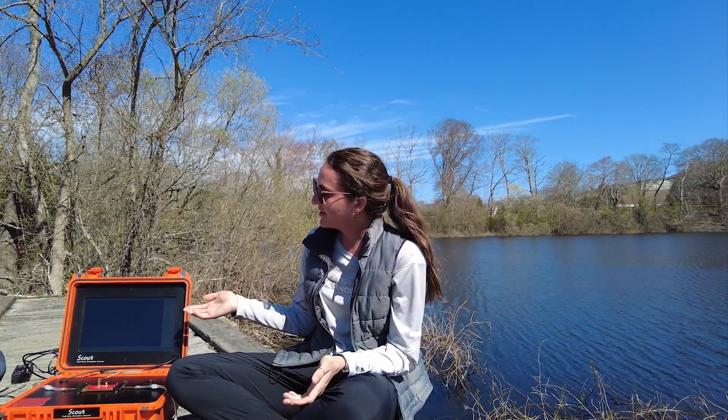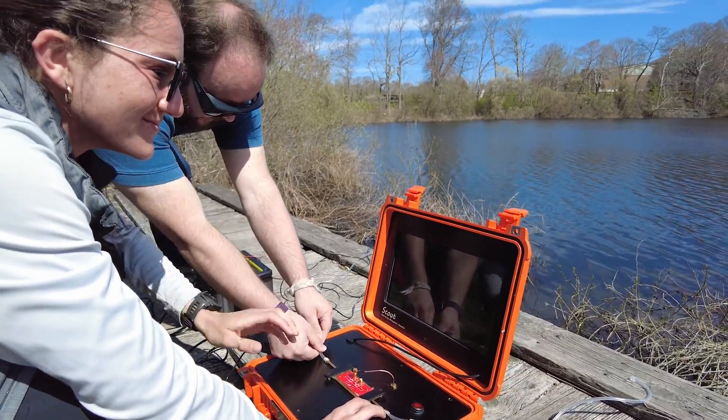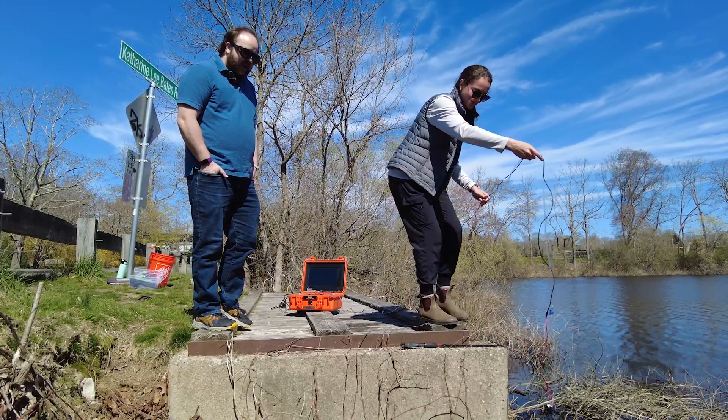So we built Scout, which is a field-going microplastic sensor. It is a flow-through sensor, so it essentially detects plastics and other things in the waterways without much human interaction.